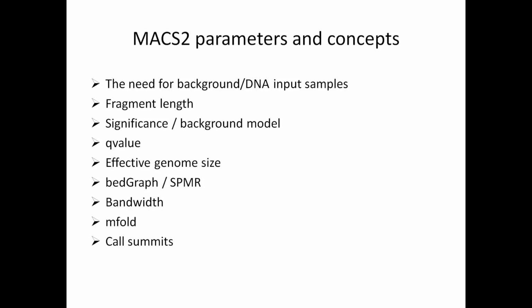Now this is useful because if you suspect there to be many binding regions clustered together, this potentially allows you to separate those out, whereas before you'd only focus on the one summit in a binding region. The only thing to be careful about is that in the later stages where you want to extract sequence around a summit, or in this case separate subpeaks, you need to make sure that the sequences don't overlap.